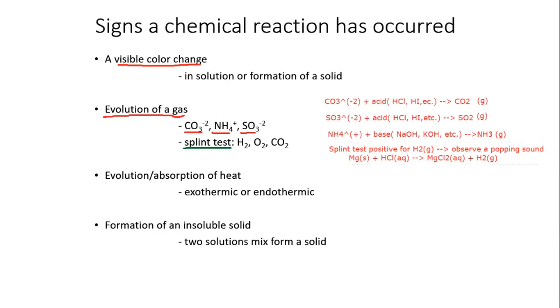The reason H2 makes a popping sound is because when you bring the splint or the match near the mouth of the test tube, it ignites the H2, and then the H2 combusts with the oxygen in the air to produce a popping sound. So when you combust the hydrogen, a popping sound results, because H2 is combusting with the oxygen in the air.